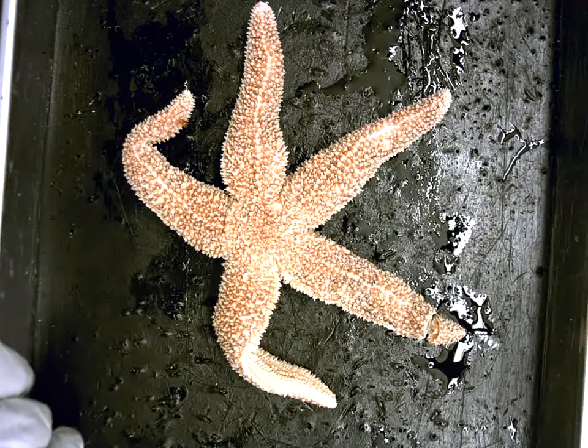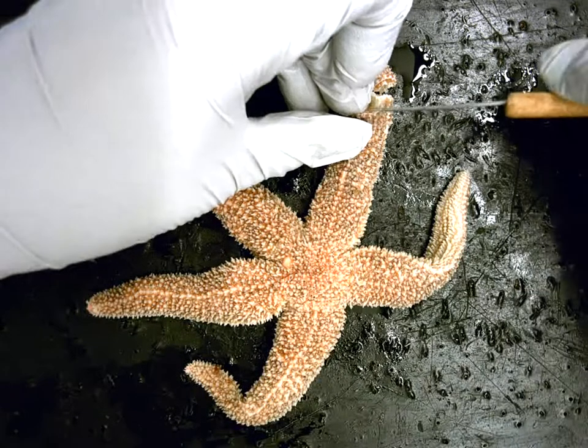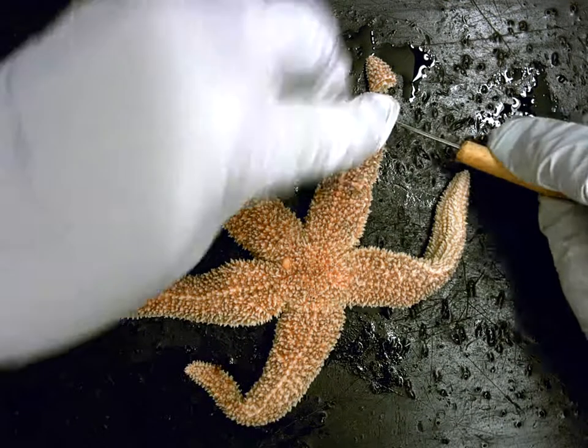So we're going to be able to hopefully see what's inside. I'm going to rotate this just a bit and take a look. As I pull up the arm, I'm going to use my probe to pull down the organs that are kind of sticking to this top surface.